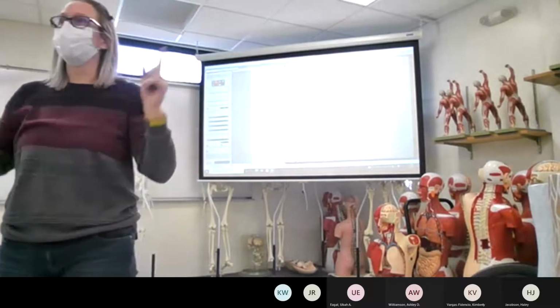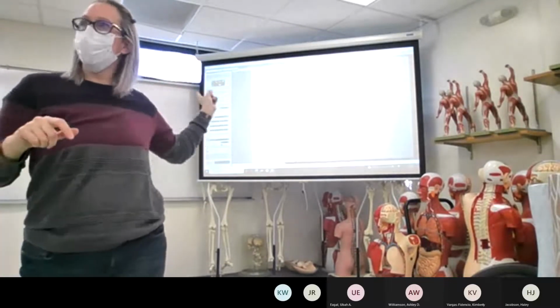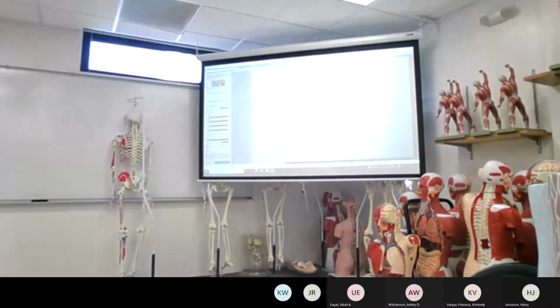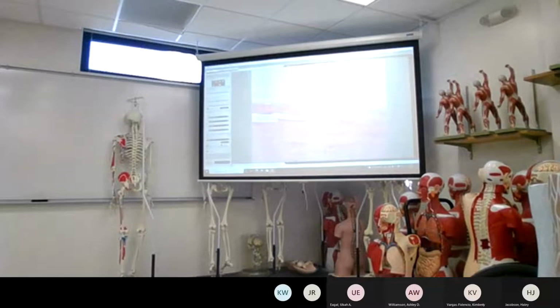Okay? Because again, that is a hard thing. You just see pink. And pink is very closely like, is that muscle or not? Okay, so I would give you a clue. All right, so that was number 9. Let's go to number 10.